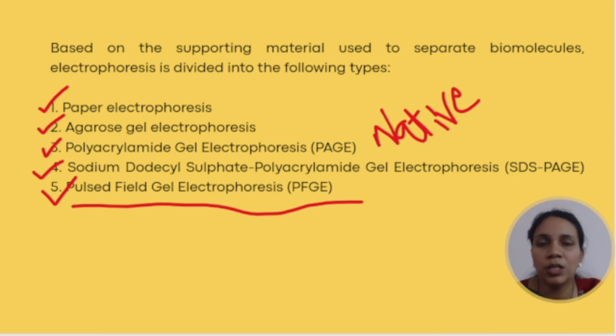So I was working in one of the labs. There they were working on a particular zoonotic bacteria. So there it was a very common practice of using pulsed-field gel electrophoresis.